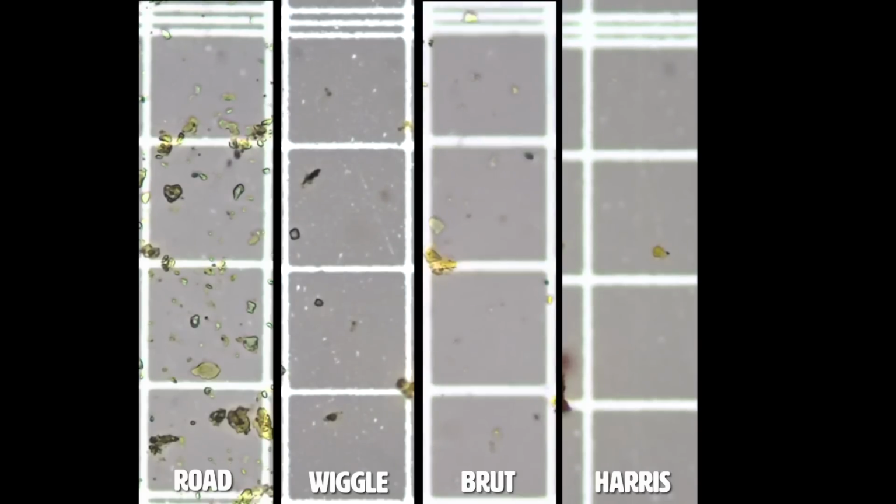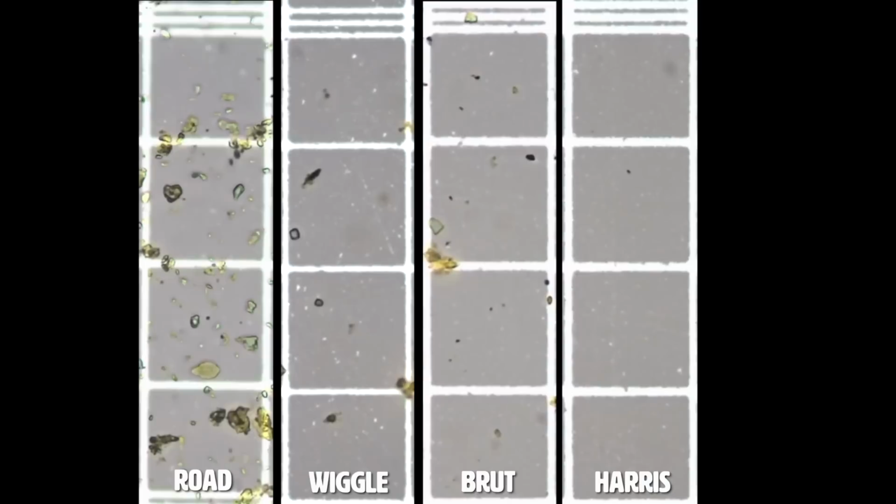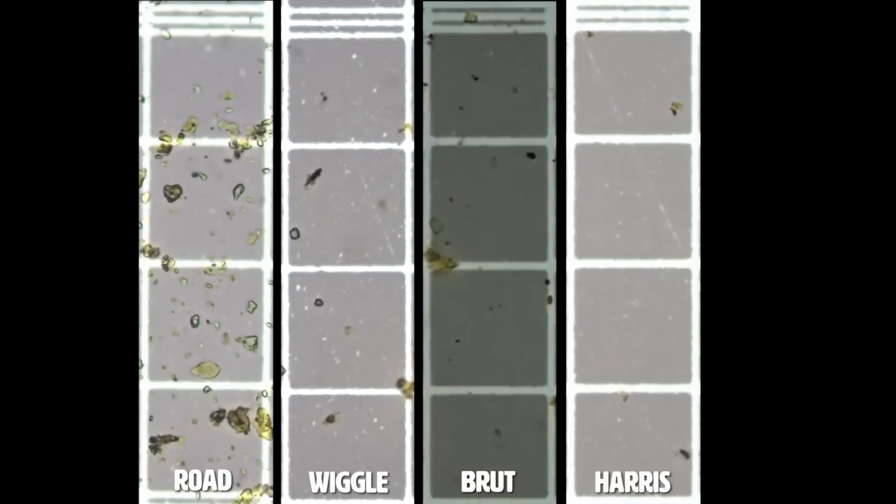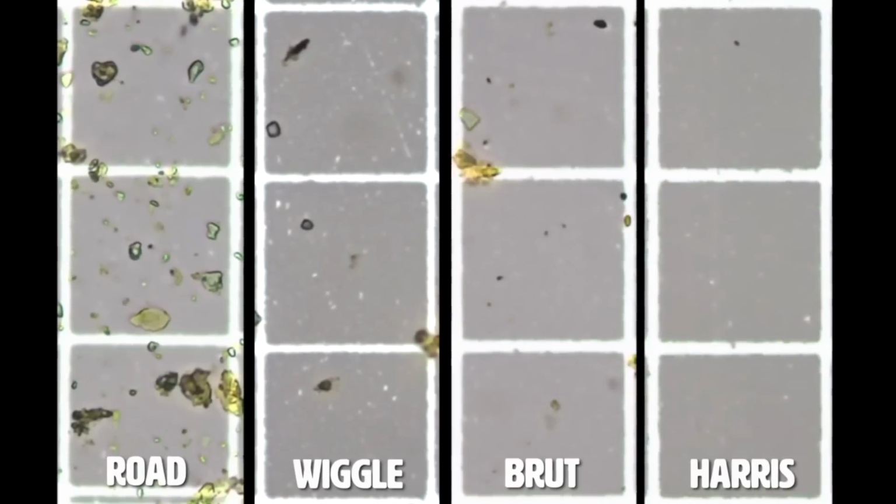And I wanted to tell you about this one because it's something that I created. It's something that I'm sharing with the people I train, but it's also something that you can easily understand. It's something that we're just going to dive into right now. Here we go. So we're looking at a side by side. And this literally is different samples that we're viewing side by side. That's exactly what it is. And so you can compare in real time the difference between things.